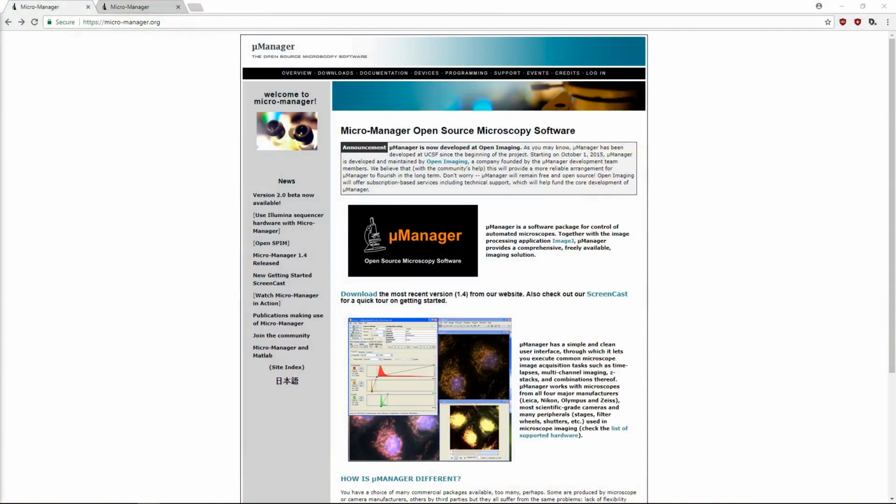The Micromanager website is micro-manager.org. The niji will be supported out of the box in the next 1.4 or 2.0 release, but until then you will need to download a nightly version.